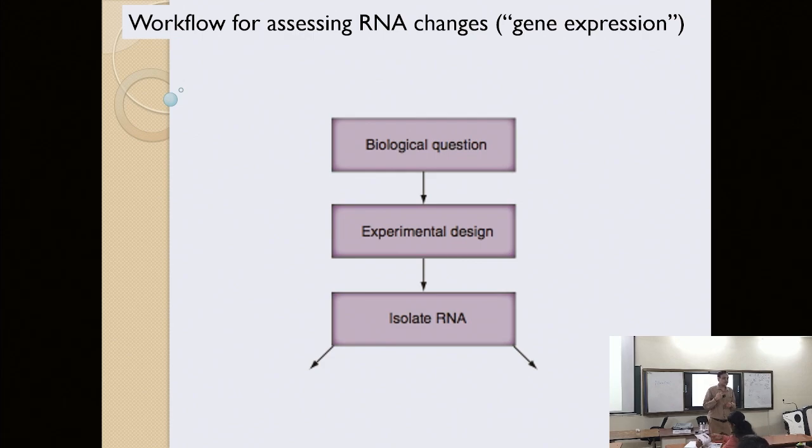Collect RNA from me, but collect in triplets. So you understand replicates? Okay. So we want to understand biological variability. So that's why we want to get data in multiples of samples, actually, representing different times, or some different conditions or whatever you say.